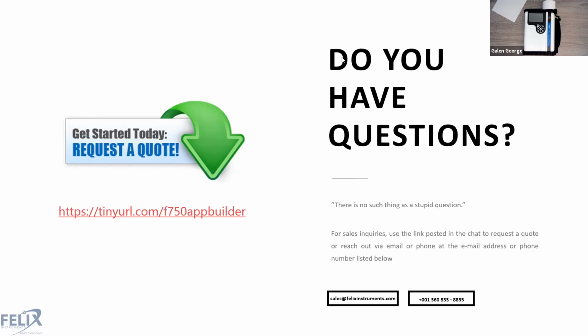If you do have questions about upgrading your instrument, then you will want to email us directly at support@felixinstruments.com and send your serial number of your instrument to us. If you have a relatively new but not brand new instrument, a Gen 1 that was from one or two years ago, there is going to be a fix, or a patch for the firmware, that will allow you to upgrade to the newest firmware and AppBuilder. It is coming, and we will announce that it'll be in the coming month. So just please be patient as that gets rolled out.